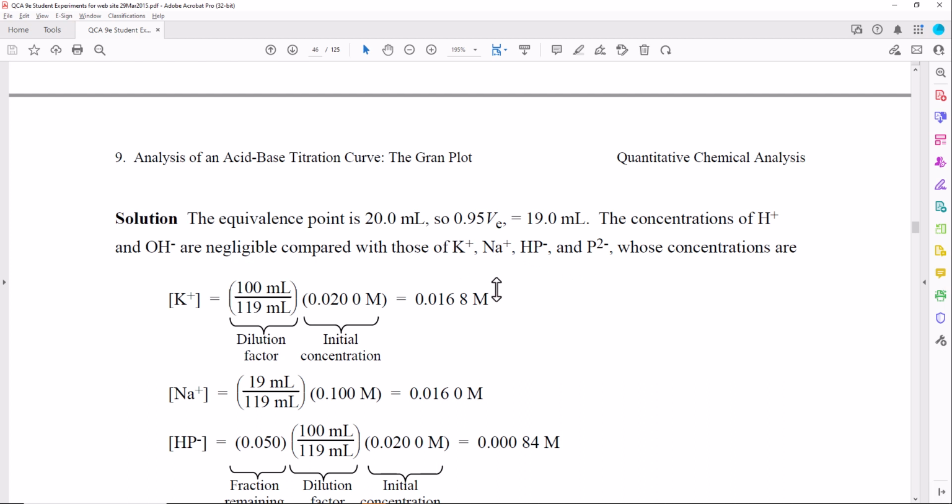Yeah, so remember that you dissolved potassium hydrogen phthalate. That's what the H and the P stand for. And so we're going to get those ions when that salt dissolves into the water. As we do the titration, we're adding sodium hydroxide, so that's where we're going to get the sodium cations from. And then as we do that titration, those hydroxide ions are going to react with the hydrogen in the hydrogen phthalate and make water molecules. So those OHs are kind of going away. And then we're going to produce a P2 minus once we've reacted the H plus off this molecule, right? So that's just a basic acid-base reaction.